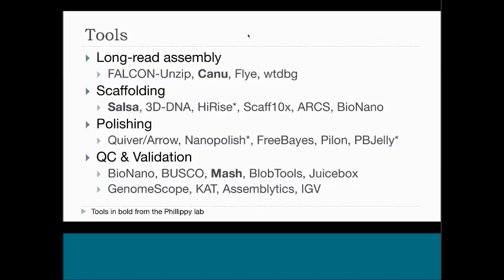And in fact, for our ongoing mosquito projects, I have four assemblers listed here, and we're in the active process of running all four of those on the same genome. Then we look at the outputs and see how they're behaving in the presence of this heterozygosity, which of them are collapsing those bubbles, which of them are breaking them out, what the resulting genome size is as output from the assembler, and which of those then work best to feed into scaffolding. And so that still is a very manual process, evaluating multiple assemblies to try and pick which one is best for your needs.